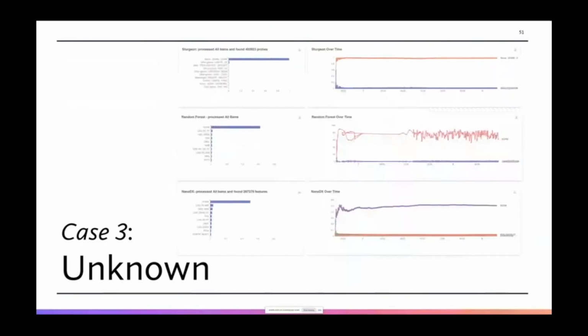And so we had this sample, and here I am showing 3 plots. These 3 plots identified this, unbelievably, to be a schwannoma, that very same tumour type that had got Simon interested in using Nanopore originally. But not only that, Simon said if this really is this schwannoma type, it should have a particular fusion.